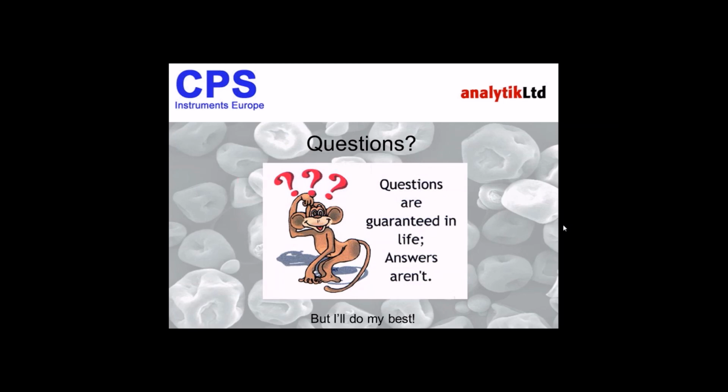What if I didn't know the particle density? I think I've covered that over the last few slides. The other question I've got is, does it give any information on shape? How does it work on non-spherical particles? Very simple answer. Unfortunately, like with all techniques, we will only be able to achieve the weight equivalent spherical diameter. So it does not give information on shape, I'm afraid.